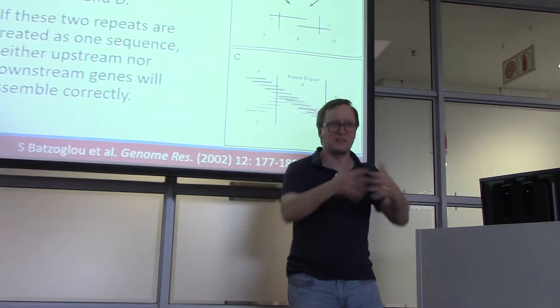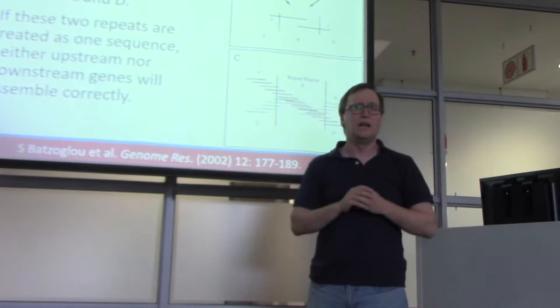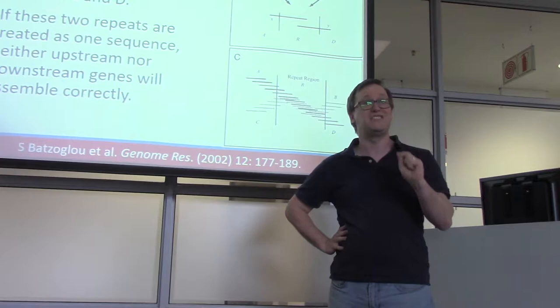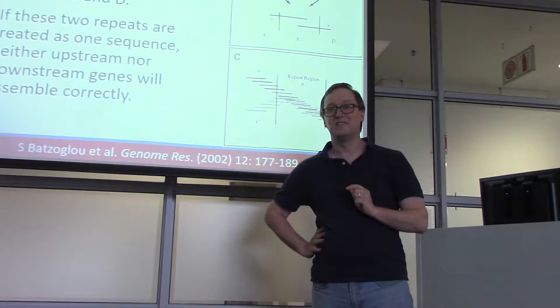Okay, so I also want to note that this paper that I'm talking about from 2002 is about the Arachne genome assembler. I find the name kind of difficult. Betzoglo, perhaps? I'm not sure. But this paper came from an individual's PhD thesis. And in his PhD thesis back in 2002, he was able to demonstrate that you could assemble an entire Drosophila genome on a desktop PC. This is not something people thought was possible before.